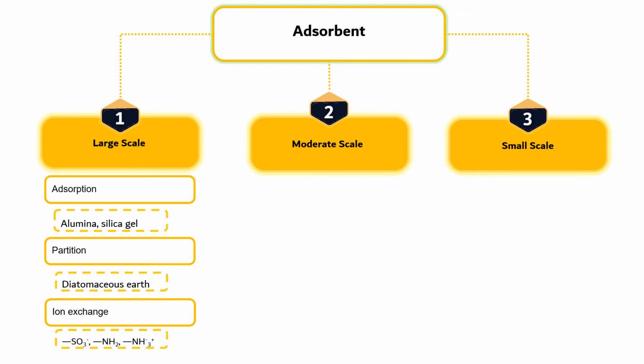For moderate scale, there are two types of chromatography, particularly gel filtration and affinity. The best current methods for moderate scale chromatography use gel as the solid phase. Two common types of gels are dextrans and polyacrylamide.